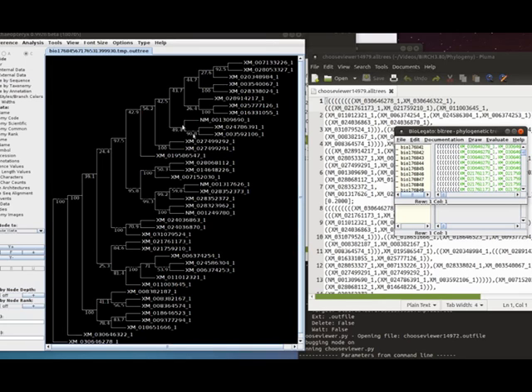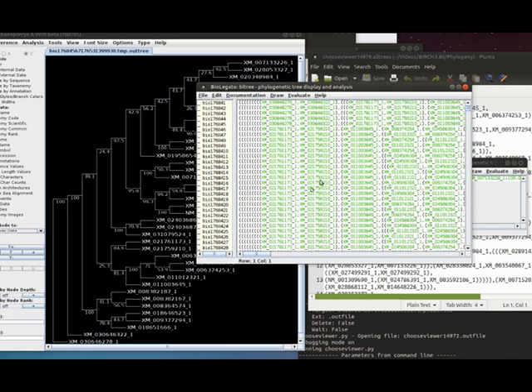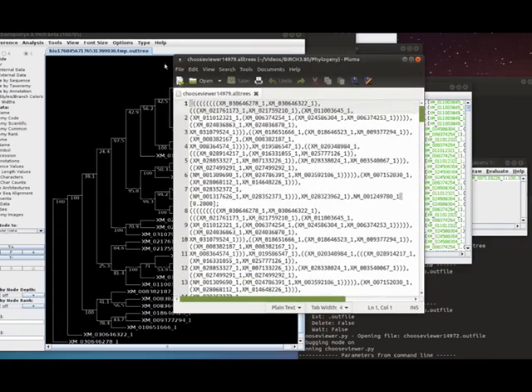So the solution comes from the fact that you can save the different bootstrap replicate trees in a file. We have it actually in two ways. We have the bootstrap trees in BL3, which is a biolegato for trees, and then we also have those same trees in a text file. I'll save the text file for later use, and then we can read in the final tree.